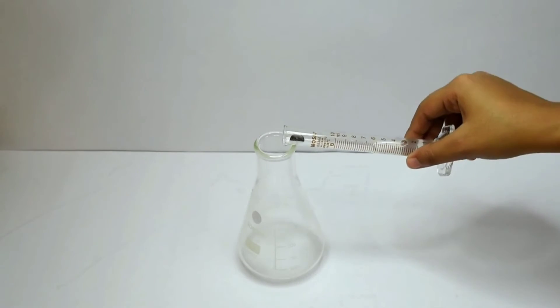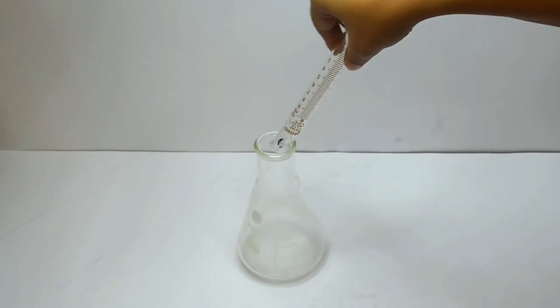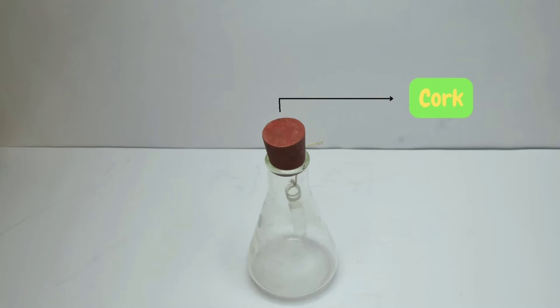This solution is then poured into a clean and dry conical flask. The ignition tube with barium chloride is then hanged inside the conical flask and secured with a cork on its mouth.